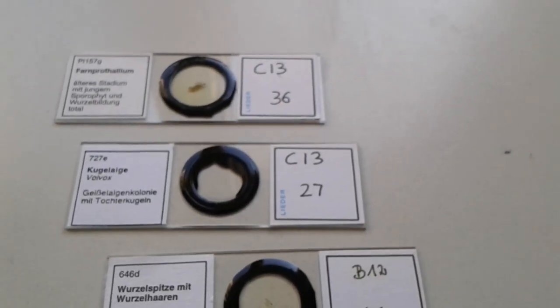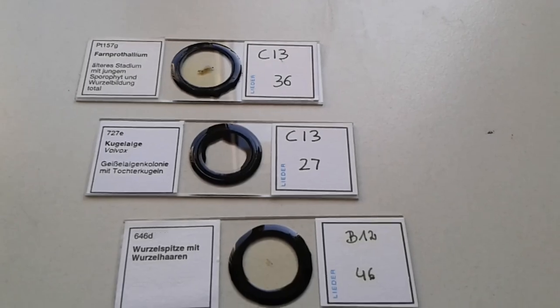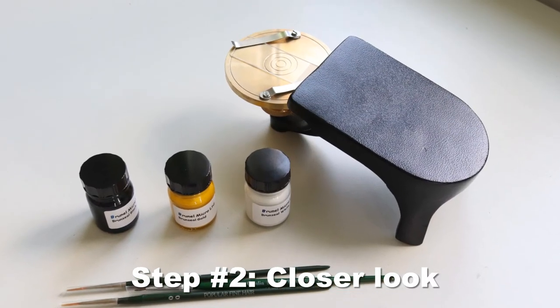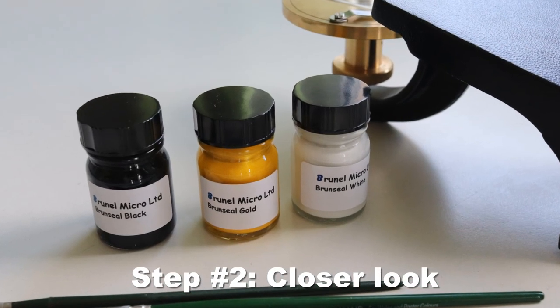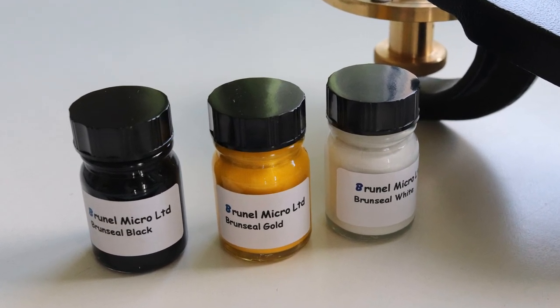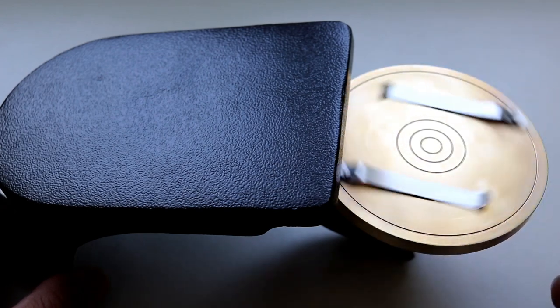These are commercial slides here, just as an example. Not all of them are ringed quite nicely—the second one from top looks a little sloppy. This is the package contents: the four brushes, three paints, and the slide ringing table itself. These are water-based paints.